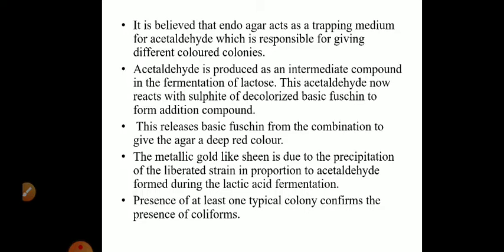When is acetaldehyde produced? Acetaldehyde is produced as an intermediate compound during the fermentation of lactose. E. coli or coliforms are lactose fermenting organisms. They ferment lactose and acetaldehyde is produced as an intermediate product. This acetaldehyde reacts with sodium sulfite, which is present in combination with decolorized basic fuchsine, and forms an addition product.